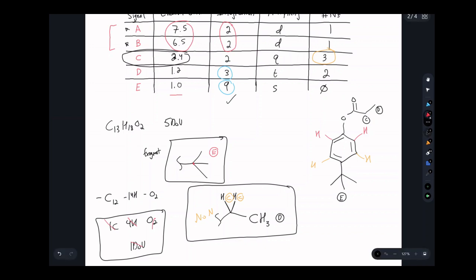Well, the key idea here is that there's an oxygen that is directly connected to the ring. This is an electron donor group, right? This is going to make some resonance forms, right, where we actually give electron density here, shielding these hydrogens, the ones that are adjacent to the group, right? Remember that donor groups donate electrons to those positions, here, here, and here, right, which we'll define more deeply in the next topic.